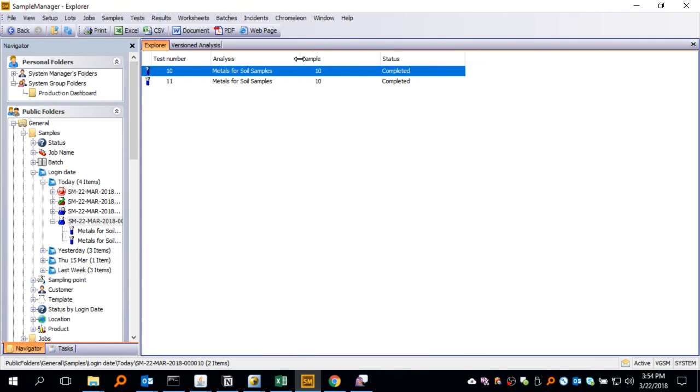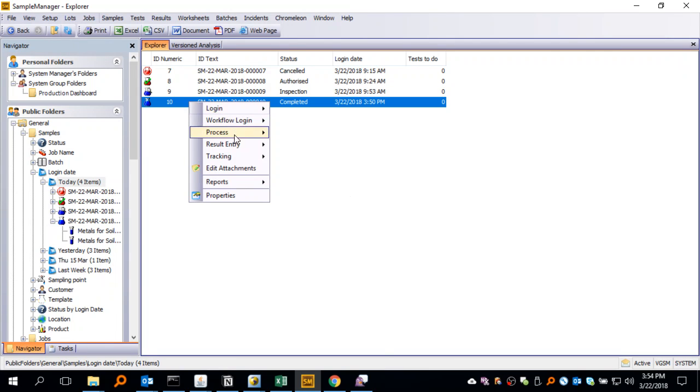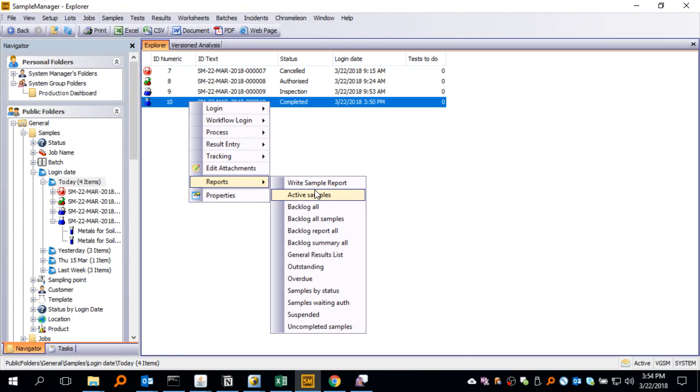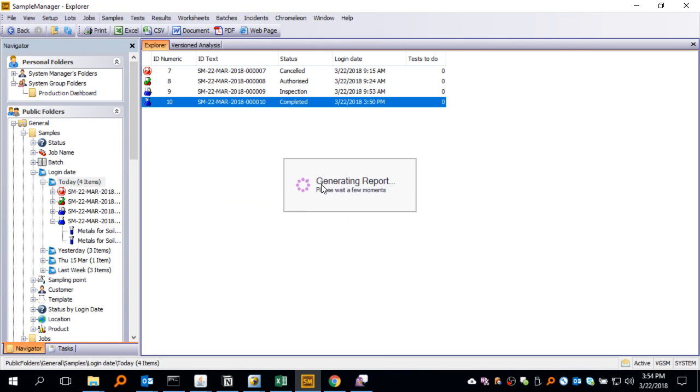Well, one thing I will mention is if you have a report, let's pretend I had a sample report. Actually, I do have a sample report. I'm going to right click on this sample and look at my sample report here, tracking sample report.